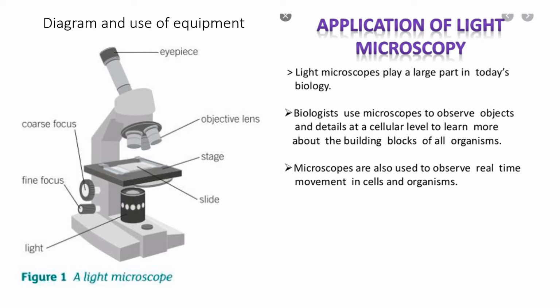Most of ours in school and ones in the books will talk about having a built-in light. However, if it's really a retro or a key stage 3 microscope, you won't have a light, you'll have a little mirror. Exciting, eh? And this platform here is called the stage, and these 2 brackets here are simply called stage clips, and the stage holds the slide in place so it doesn't move around, because you can, if you remember, tilt them backwards and forwards.